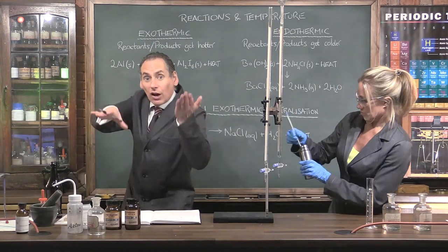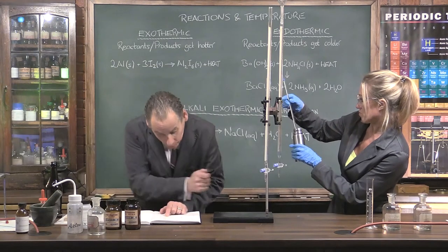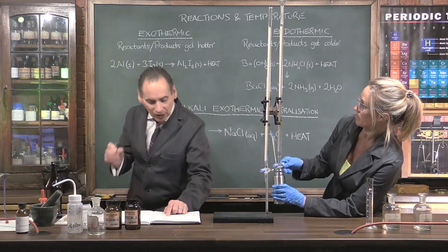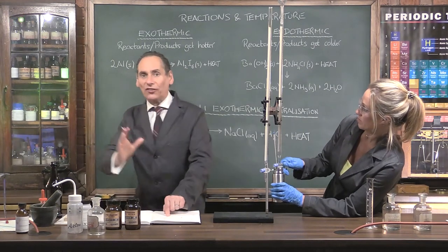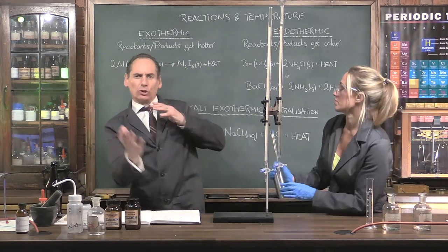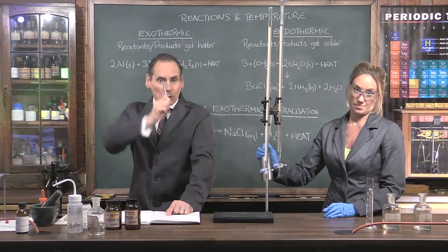We had 2 molar of each, didn't we? What are we doing? 33. All right, so let's put in some more. Another 5. That'll take us up to 35. So now we've gone past the neutralisation stage.